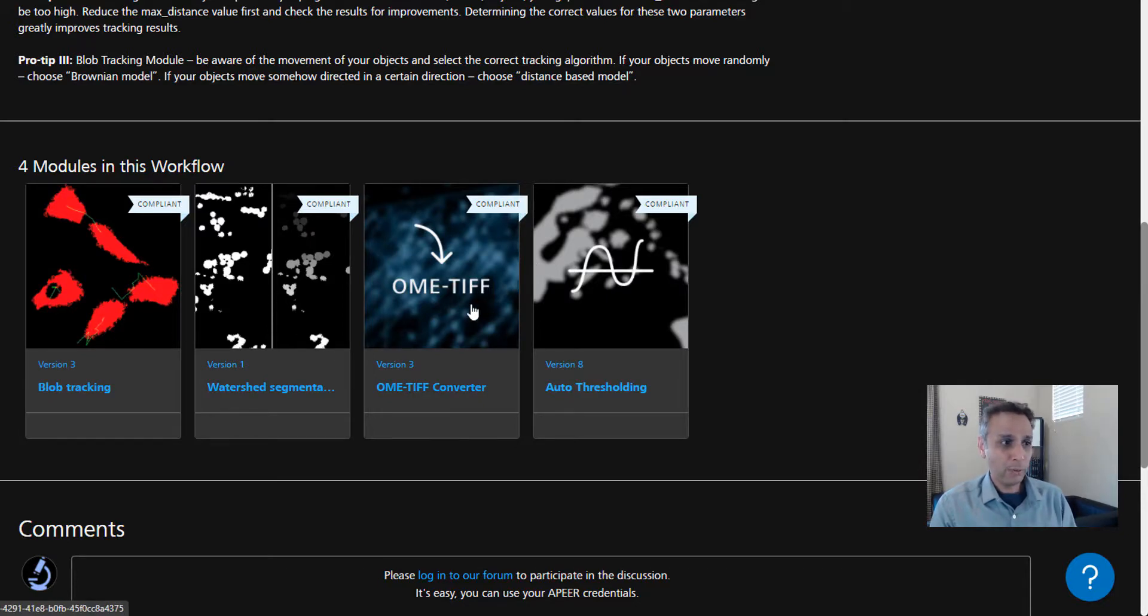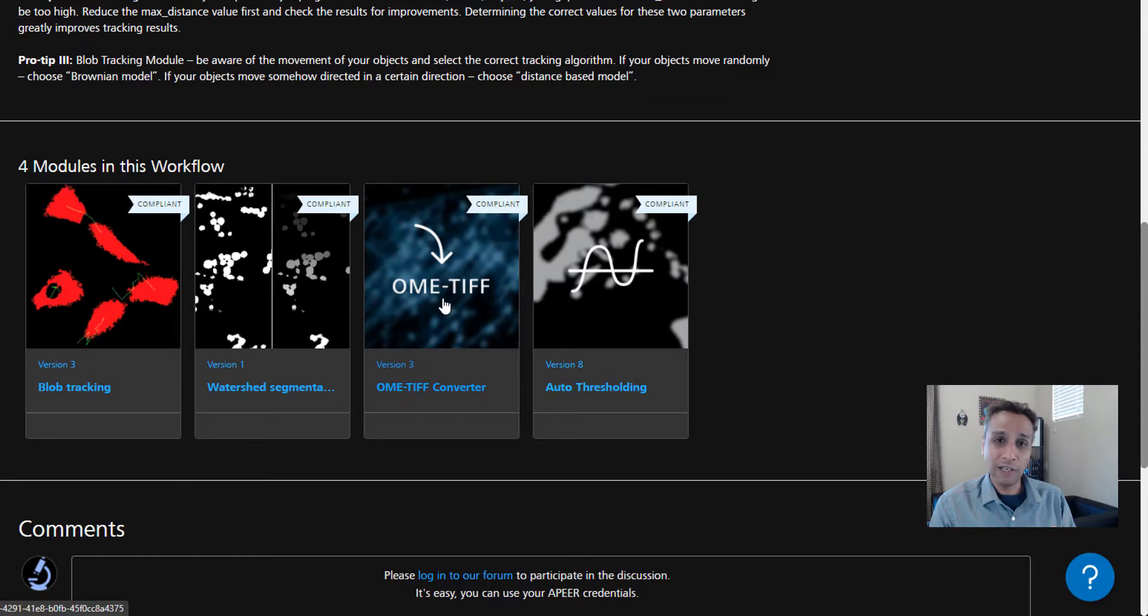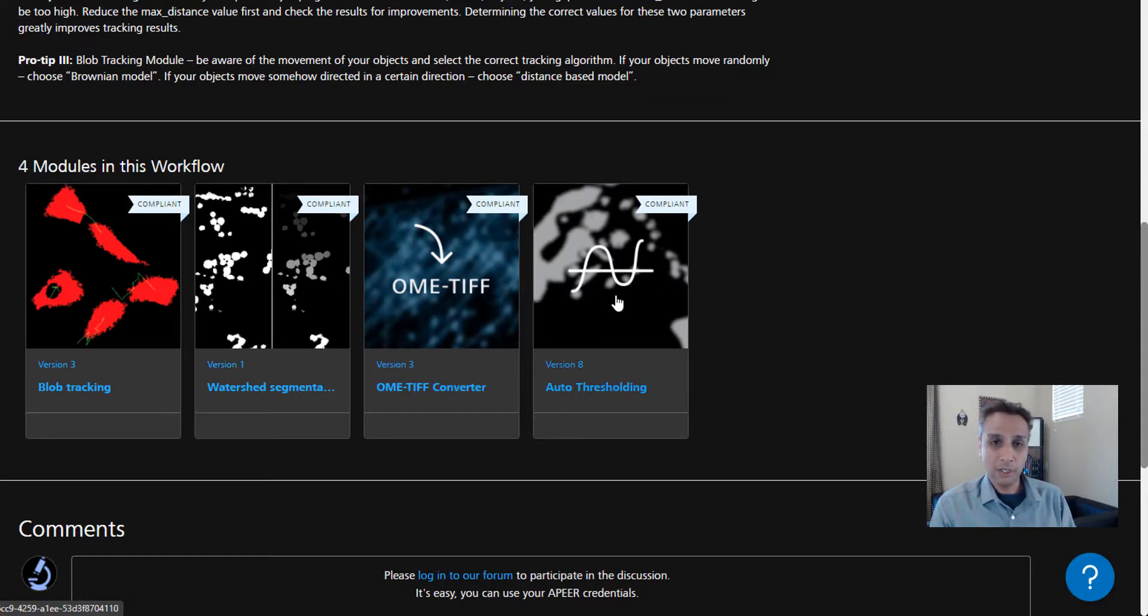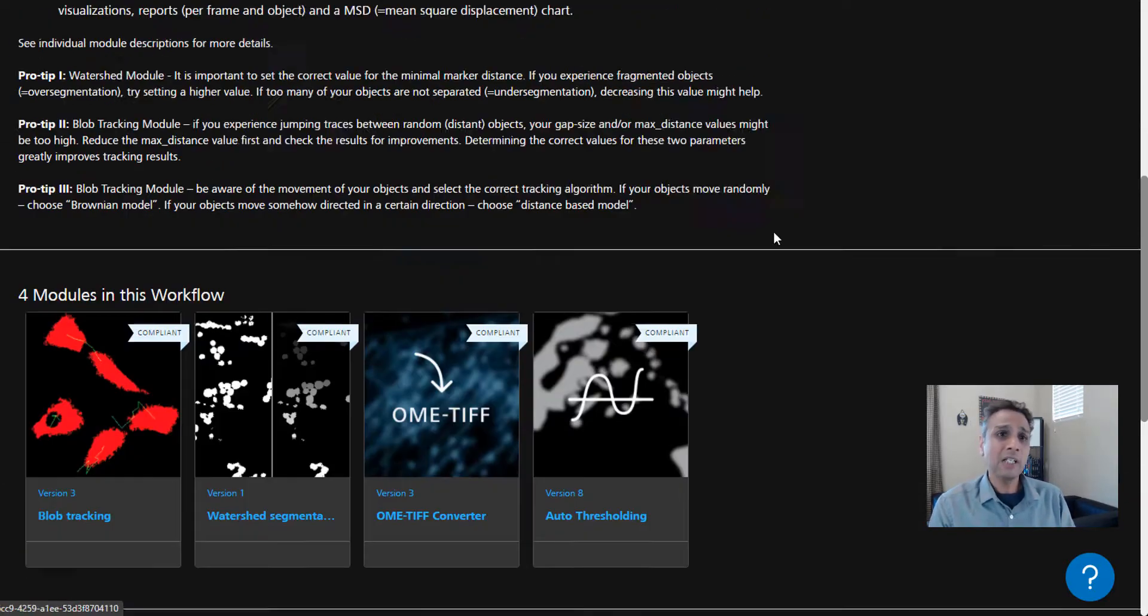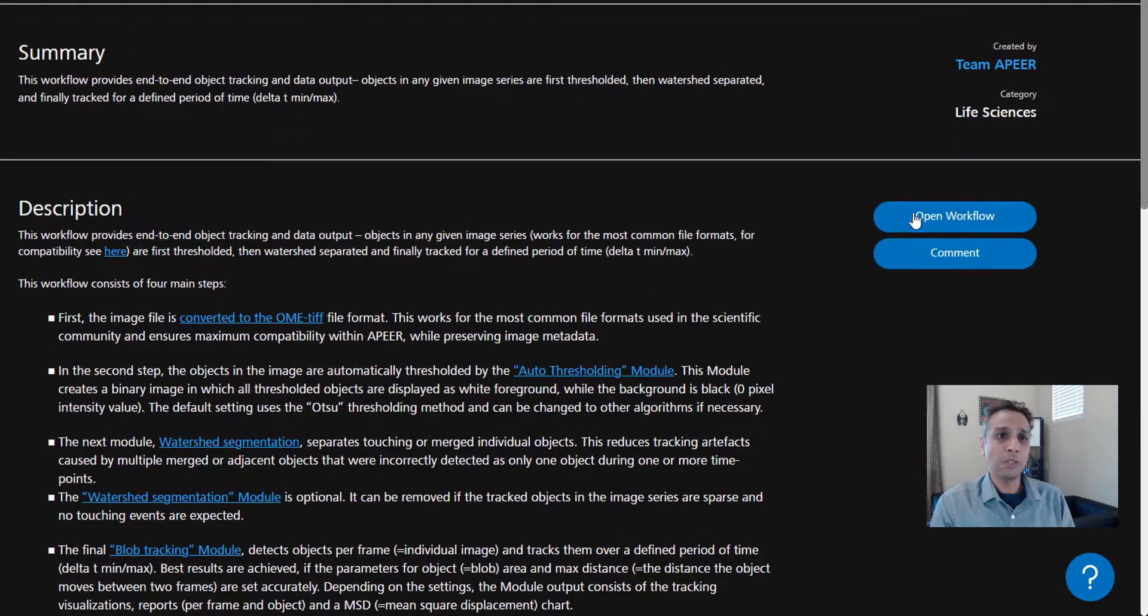If you scroll all the way down, this workflow contains four modules: blob tracking, of course, and all these other supporting modules that get our data ready to be in a format that's acceptable by the blob tracking module. First, we need to convert our input image into OME TIFF file format. Next is thresholding, auto-thresholding, and watershed segmentation. Finally, the output of watershed will go into blob tracking.